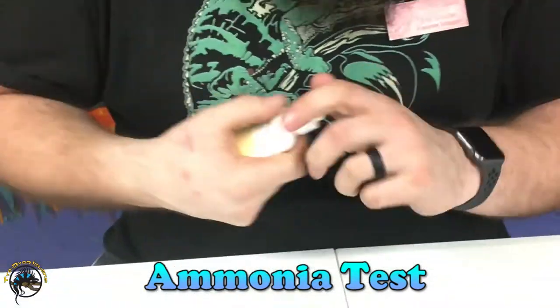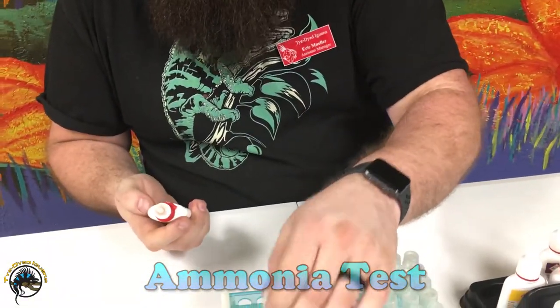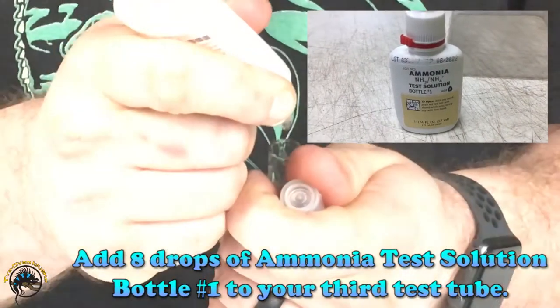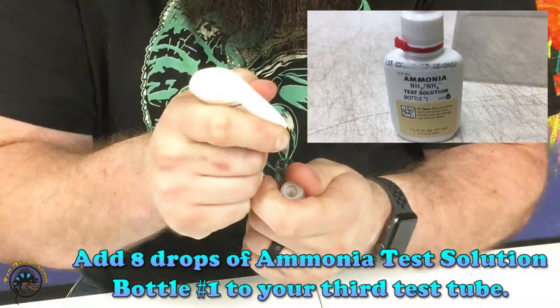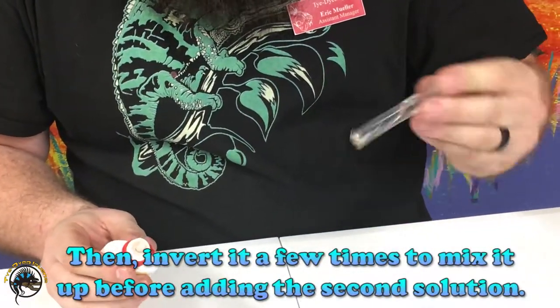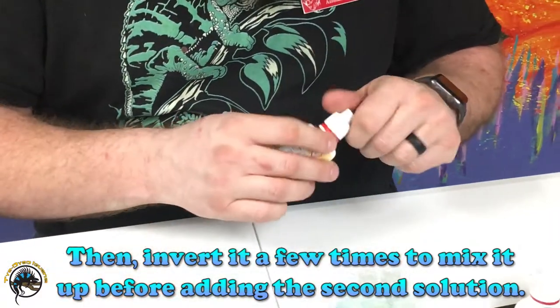The next two tests are two-bottle ones. We're going to do the ammonia one first — just kind of shake them up a little bit. Add the drops of that one and invert it a couple times before mixing in the second bottle.